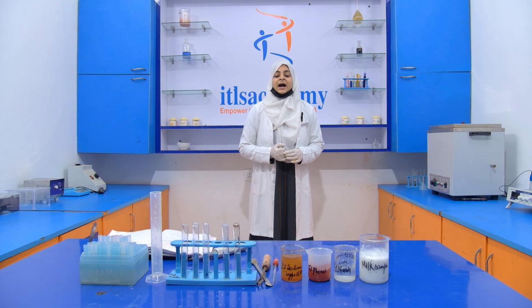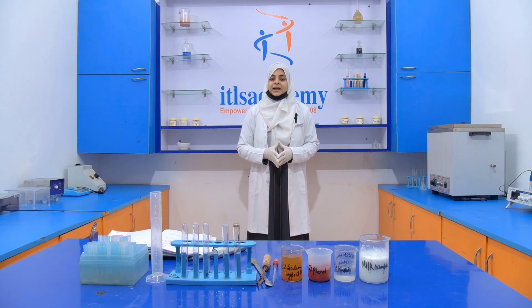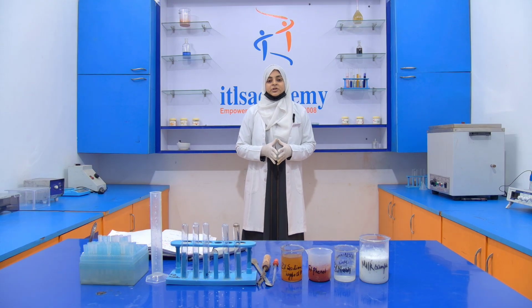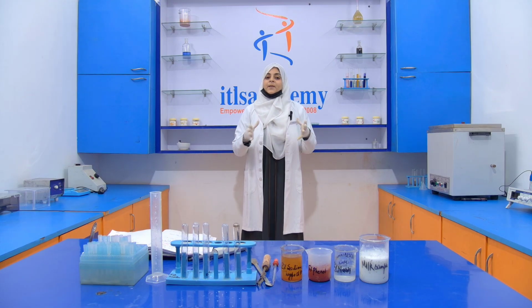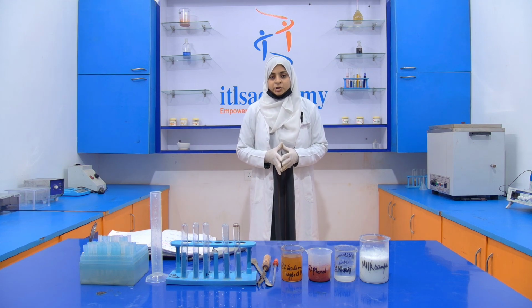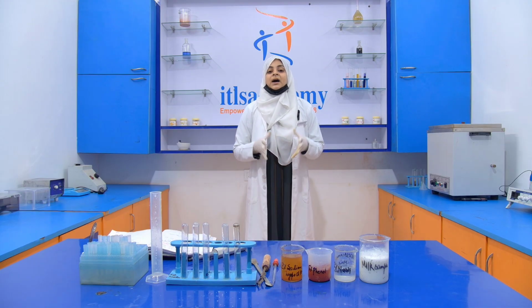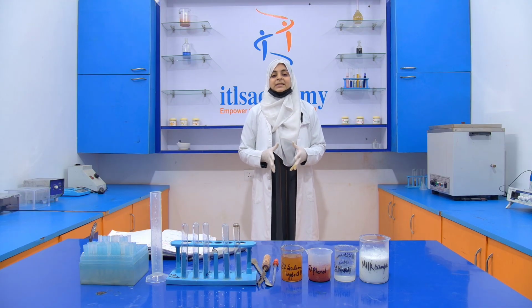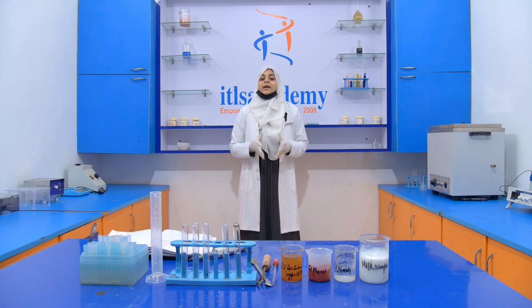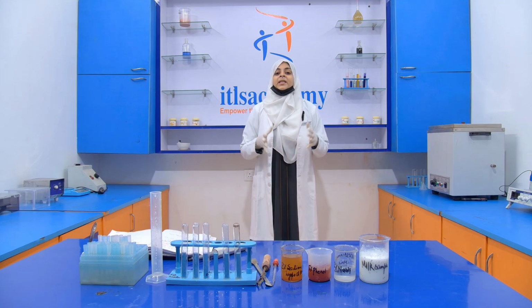But when adulteration occurs, the quality of that product decreases, and even the nutritional value of that product also decreases. This is called adulteration, and the substance used in this process is always a chemical substance. Those chemicals are known as adulterants. The FSSAI strictly prohibits the use of adulterants.